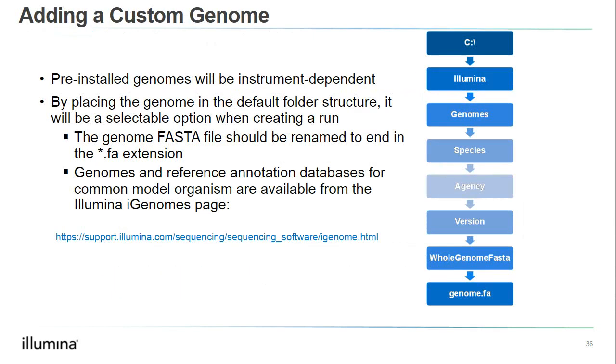The instrument will have pre-installed genomes, and those are instrument dependent, but you can use genomes that you either download from iGenomes or custom genomes. And again, if you're familiar with Local Run Manager version 2, it's the same kind of way you do it.